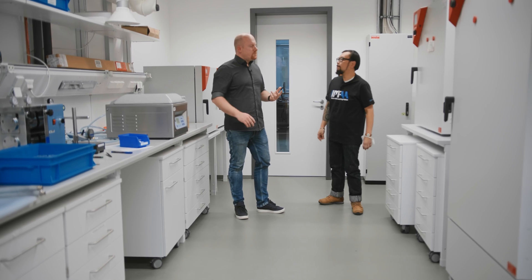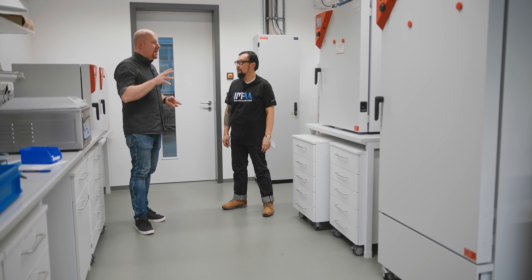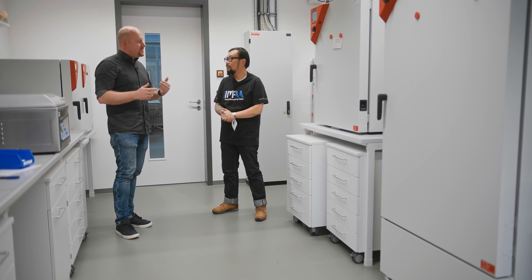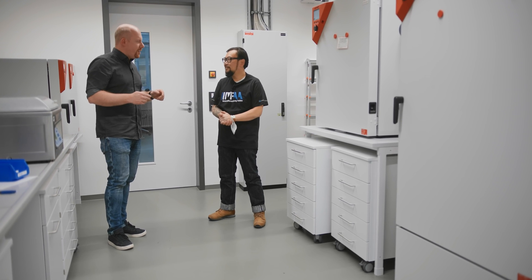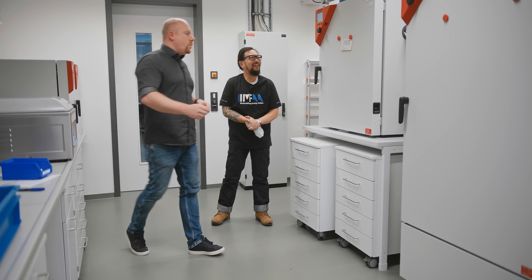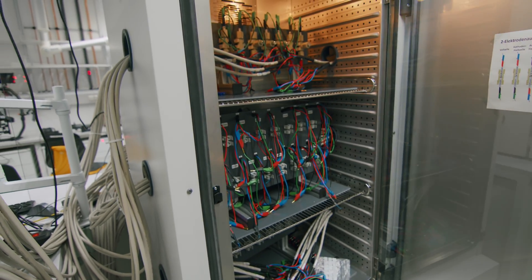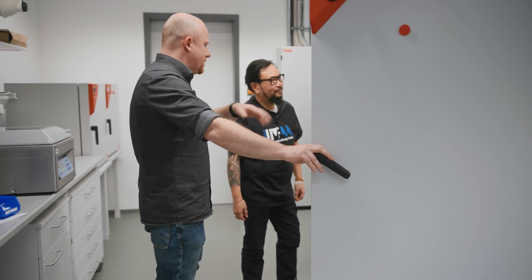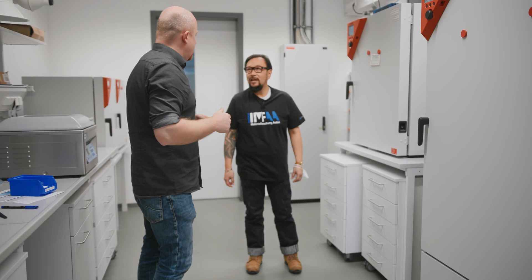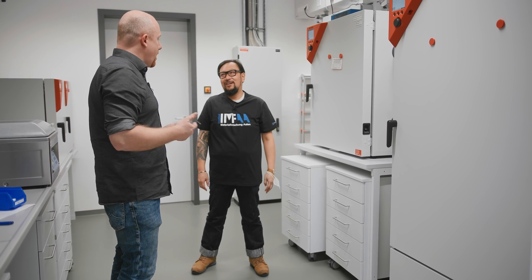So Jay, I've already shown you what we are capable of doing with cutting, grinding, polishing, and light microscopy. Here we are in the lab where we also assemble batteries and do materials development for batteries. There is some solid state battery work I'm not allowed to talk about, but there's also lithium-ion battery research which is state-of-the-art technology. What we do here is aging tests — we have a lot of pre-assembled cells that we assemble in a glove box, and all this wiring you see here is for aging cycling tests: charging, discharging, until the battery dies — and then we analyze and learn.